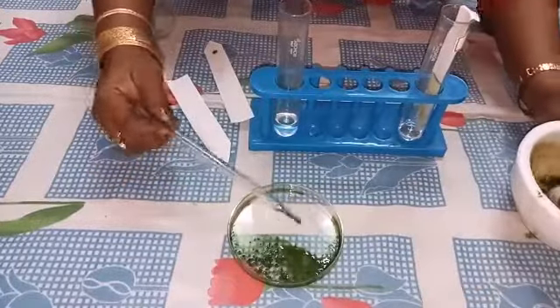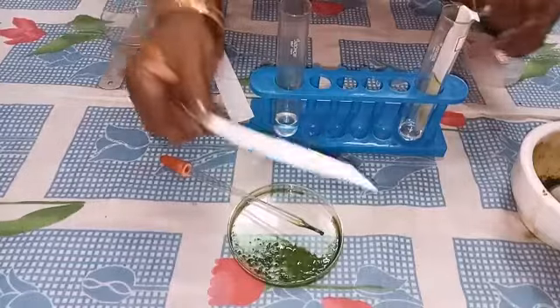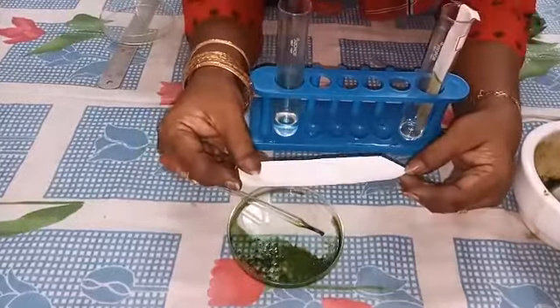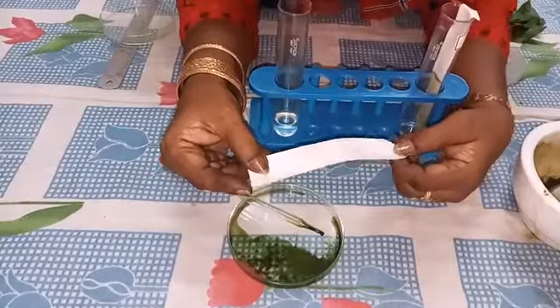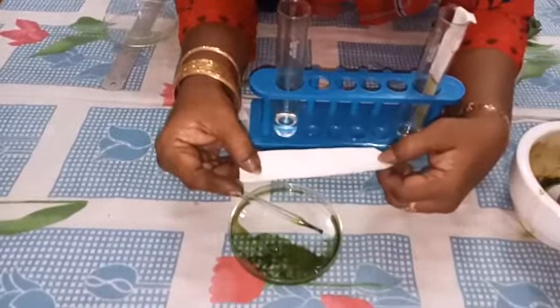Filter the extract. Now we have to take the chromatography paper. From the bottom, we have to measure 2 cm, keep one point, and draw a line there.